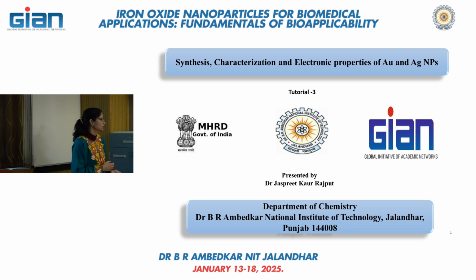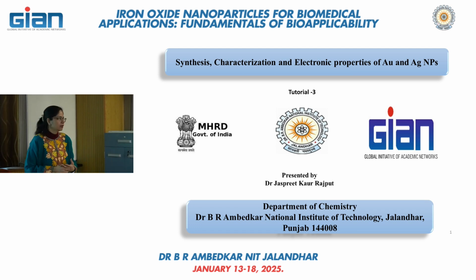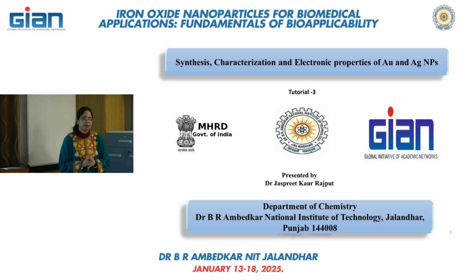In the morning, in yesterday's lecture, you have also seen how gold and silver nanoparticles can be synthesized in the presence of different surfactants, how they are stabilized, and how the color changes with the shape and the size, right? So now in today's hands-on experiment training, we will synthesize the gold and silver nanoparticles, and accordingly we can also study the electronic properties. We will study the band gap, how you can calculate the band gap of these nanomaterials through different techniques.